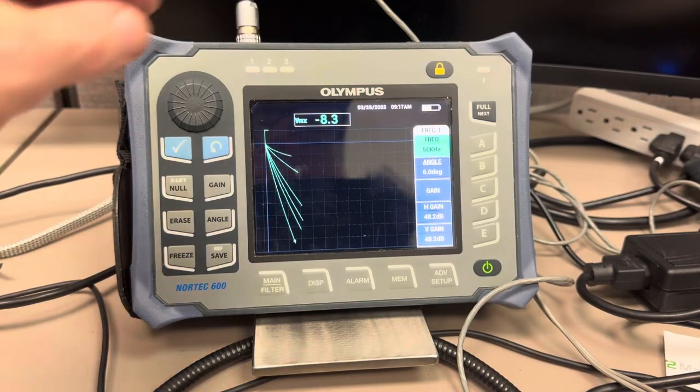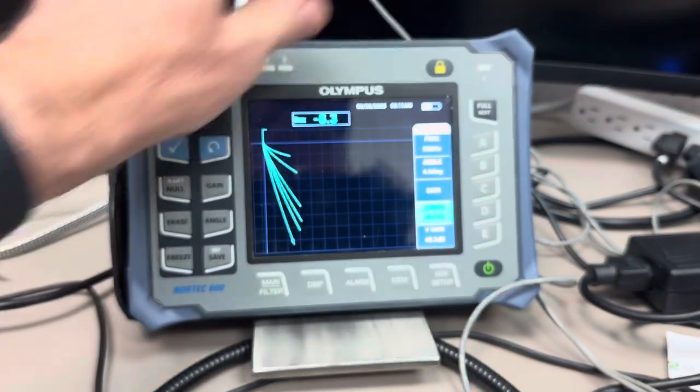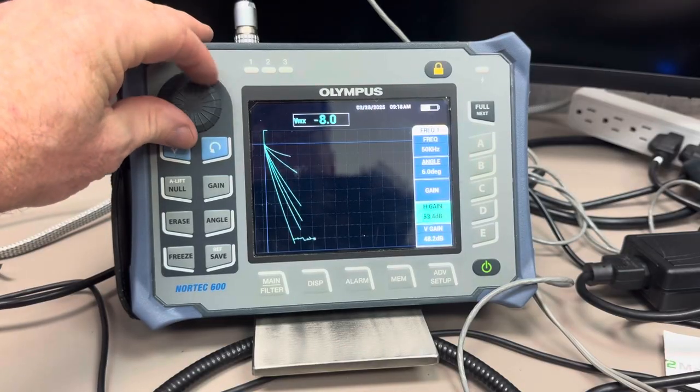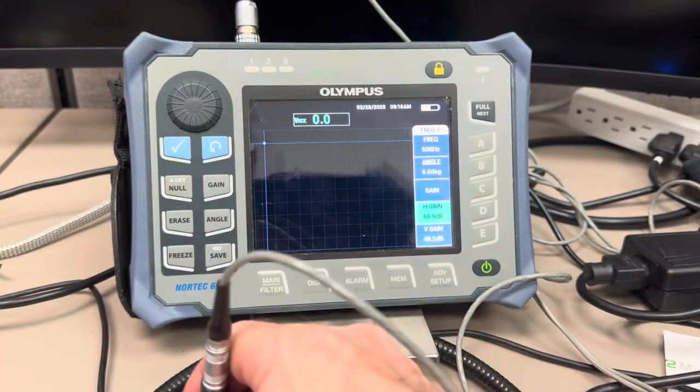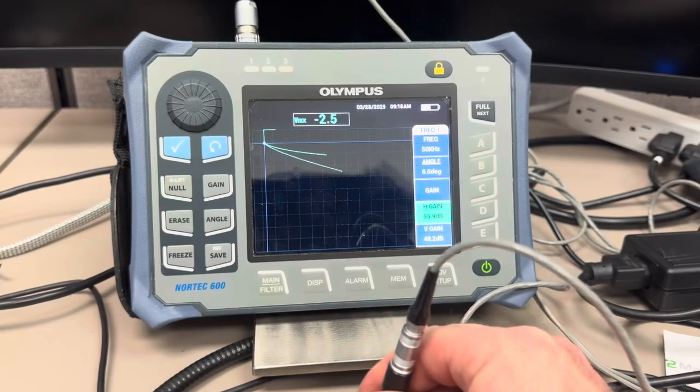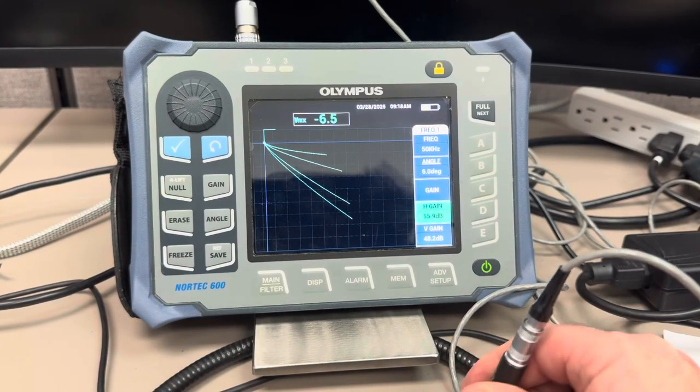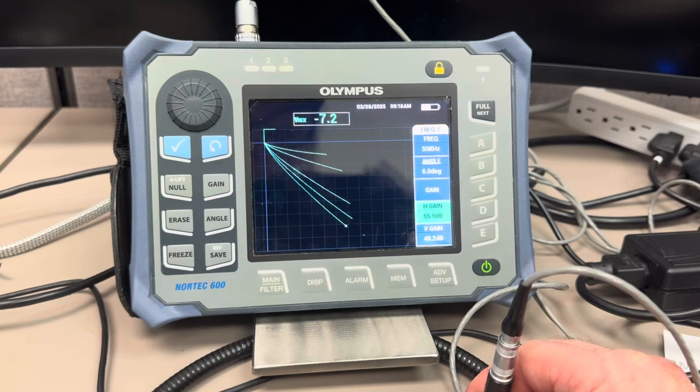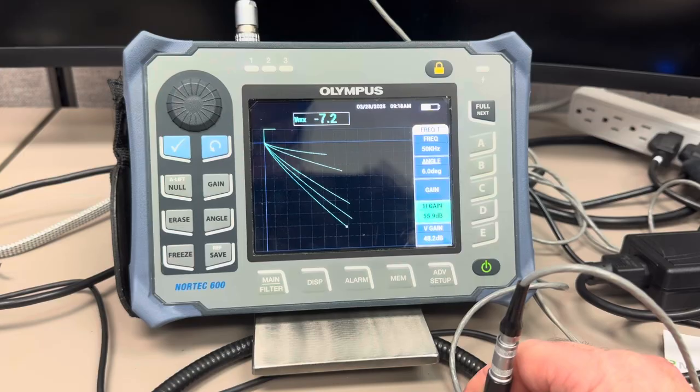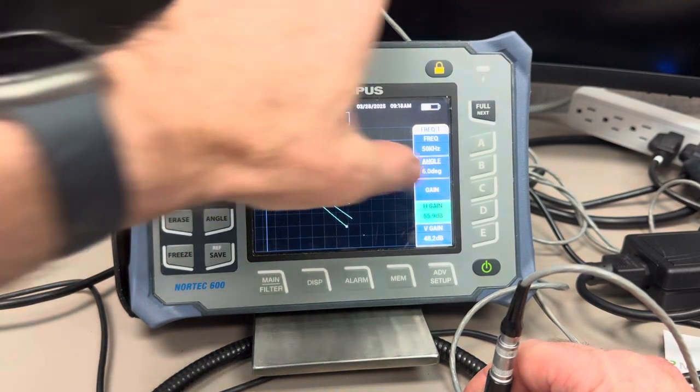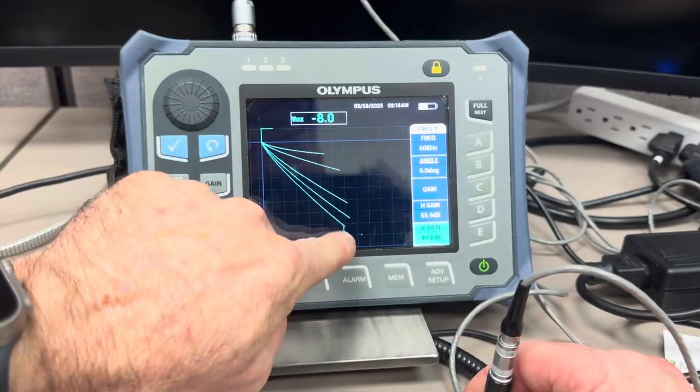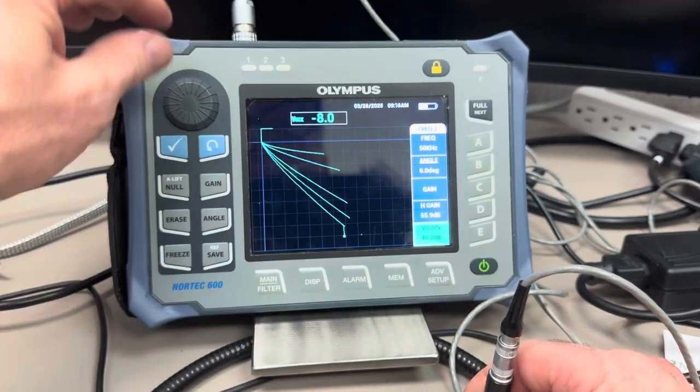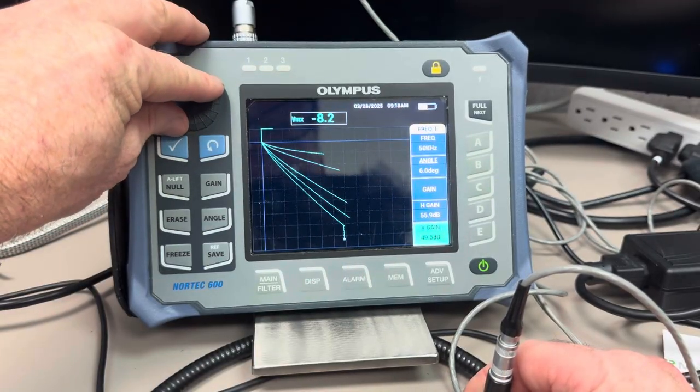Now if you want to make this curve a little prettier you can take and crank some horizontal gain into it. Now I'm holding the probe on the copper. Let's erase. Now let's see what the conductivity curve looked like. See what we did by increasing the horizontal gain was we're making it easier to identify the different materials. But let's crank in a little vertical gain here once that we're on the copper. And since we know that copper is going to be the farthest down vertically we'll just bring it right to the edge.